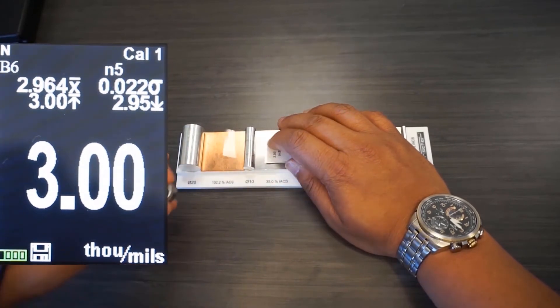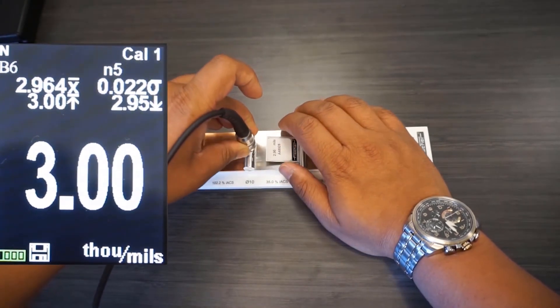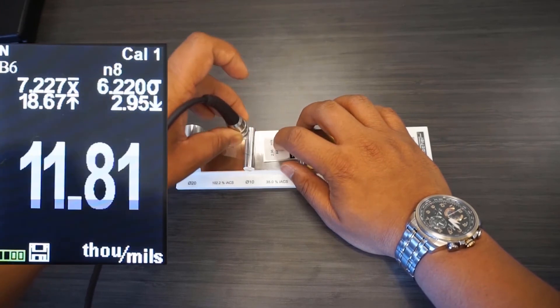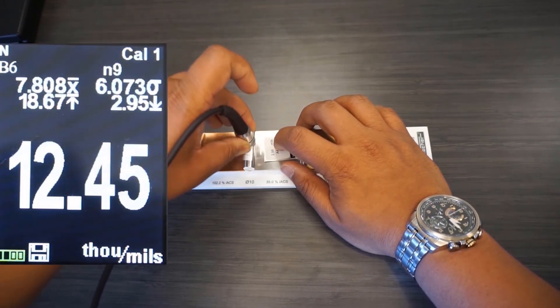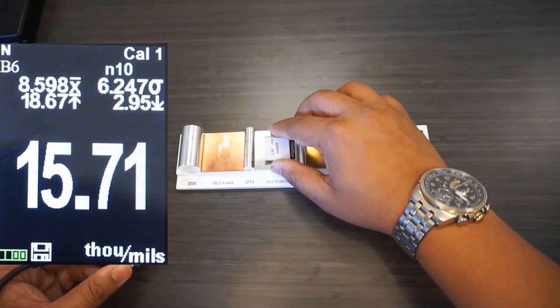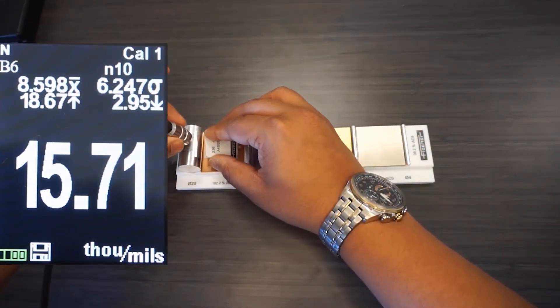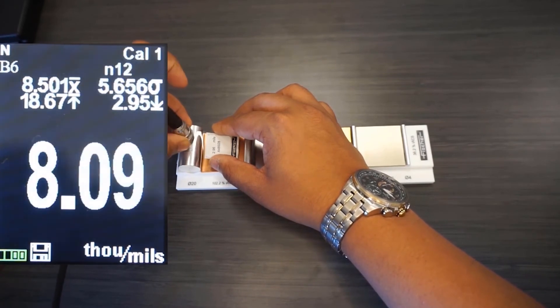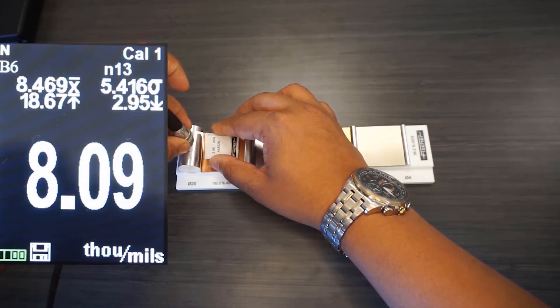But things start to fall apart as soon as I start measuring the foil on the rod as a substrate. On the 10mm rod, it's almost off by 500%. The values on the 20mm rod are better but still significantly off the stated value of 2.96 mils.